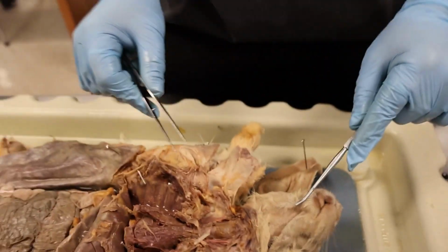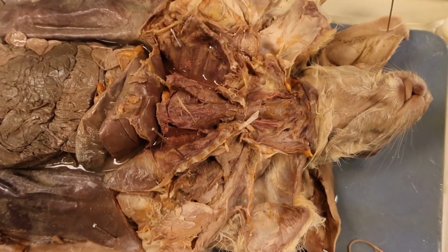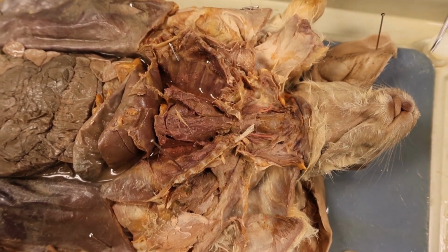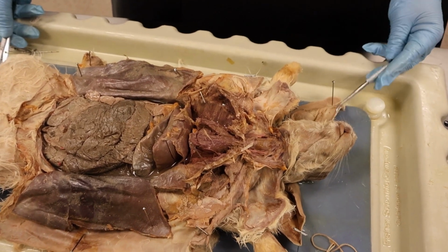To touch more on the lungs, the lungs are where the diffusion of carbon dioxide and oxygen happens. All of this exchange happens through the capillaries, and all the gas exchange actually happens in the alveoli.